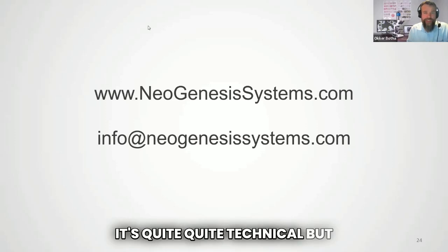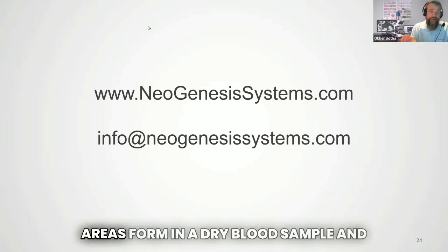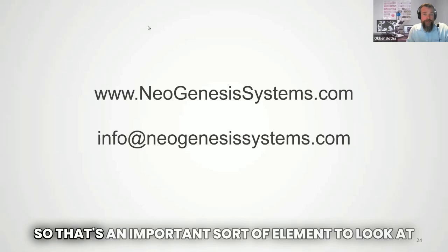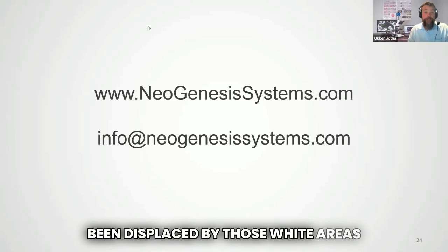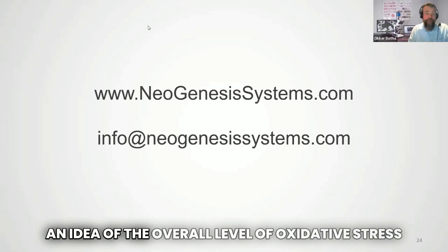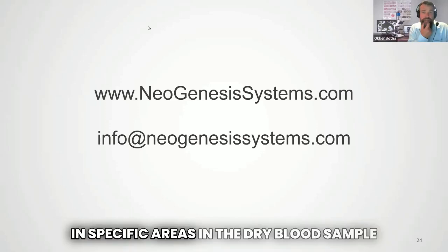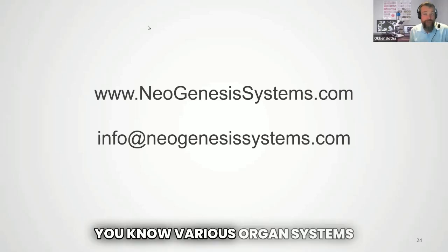It's quite technical, but research has been done into it, and we understand how those white areas form in a dry blood sample, and it's directly as a result of oxidation. So that's an important element to look at. We firstly look at how much of the blood has been displaced by those white areas, and that gives us an idea of the overall level of oxidative stress. And then we have specific organs that localize in specific areas in the dry blood sample, so we can see stress on various organ systems.